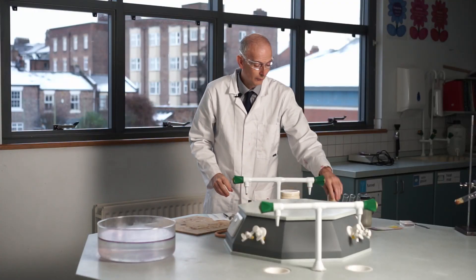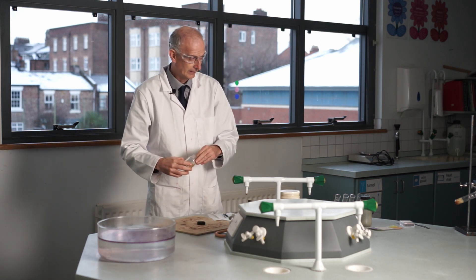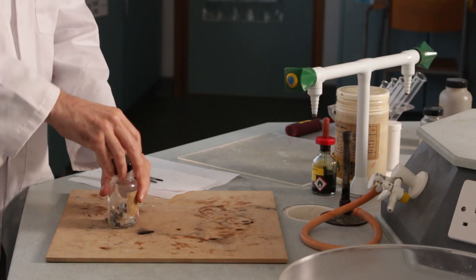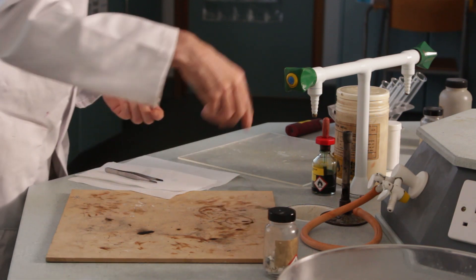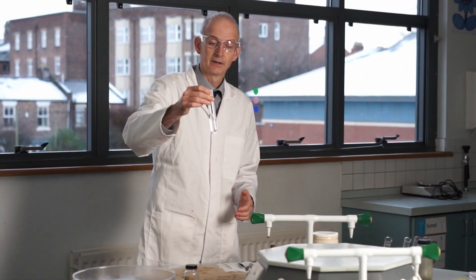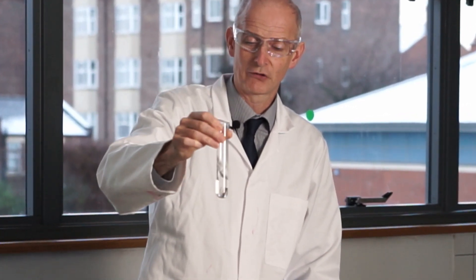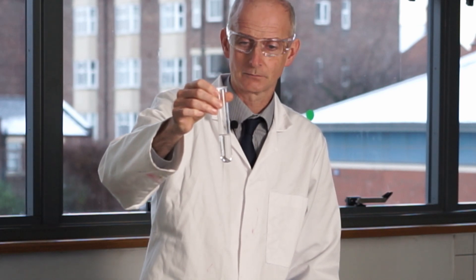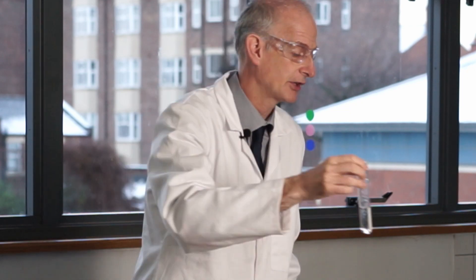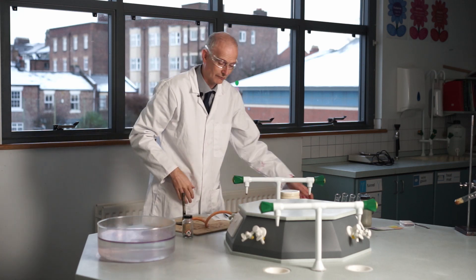We're going to go for magnesium next — magnesium strips. Put a couple of these in a boiling tube of water and see what happens. They sink and sit there. Give it a swirl, give it a chance to see if it's going to get going. Nothing doing. When nothing happens in a chemical reaction, the next thing you want to do is see what happens if we heat it.